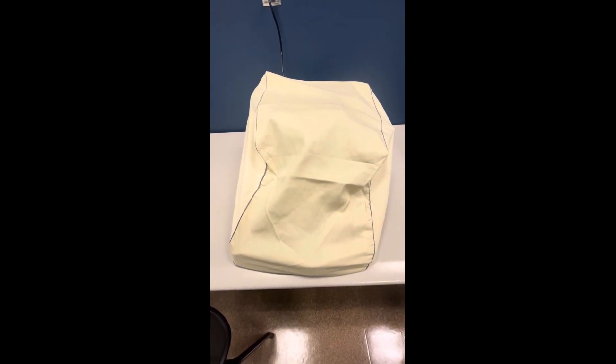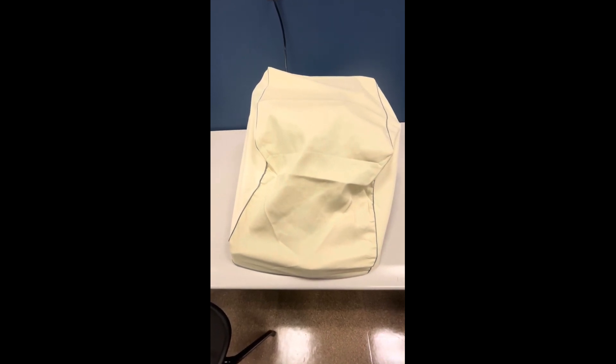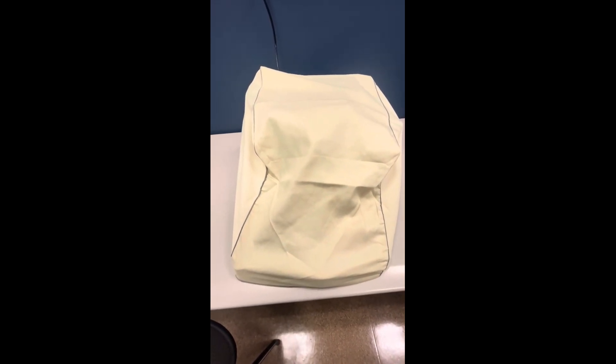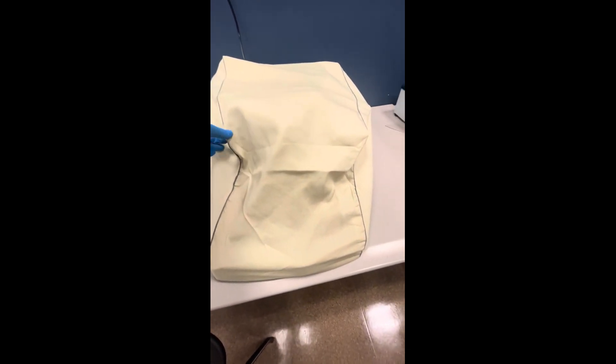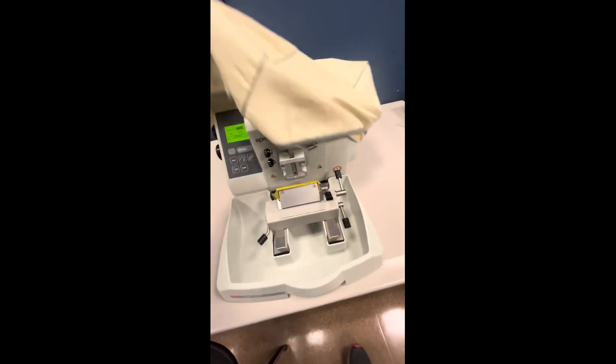Today we're going to be talking about the parts and pieces of the microtome. First we want to remove the protective cover — we can't use it with the cover on. At the end of the day, after you're done using the microtome, you want to put this protective cover back on it.